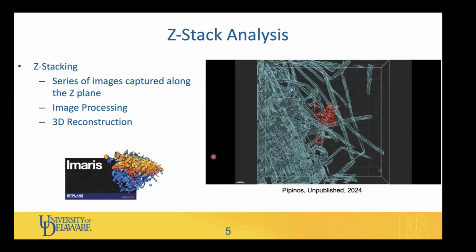And the reason we wanted to do Z stacking was to see if there was a way that we could visualize the bacteria going into the plant, so acting as an endophyte. Initially, we were really looking for that with the Z stacks.